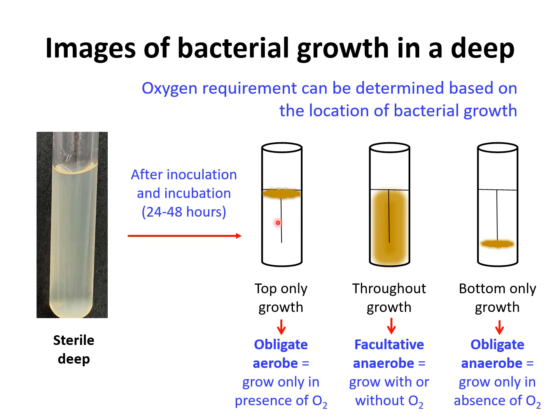So do you see how a deep can help you determine the oxygen requirement for your bacteria? How can we figure it out? Depending on the pattern of the growth that you get. And so it is pretty important that when you handle your deep, especially after incubation, you do not shake the deep tubes, okay?